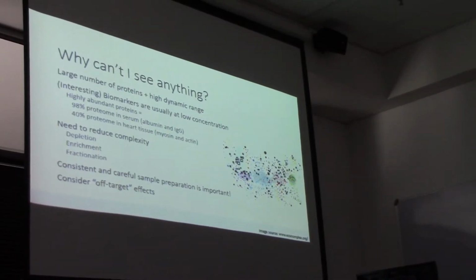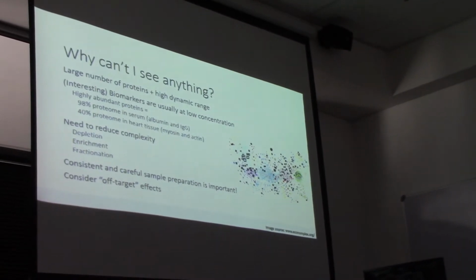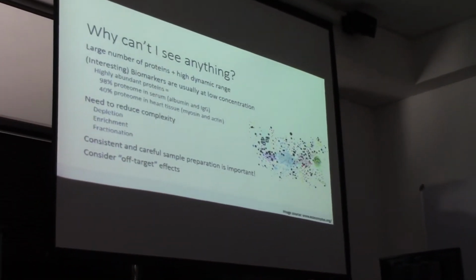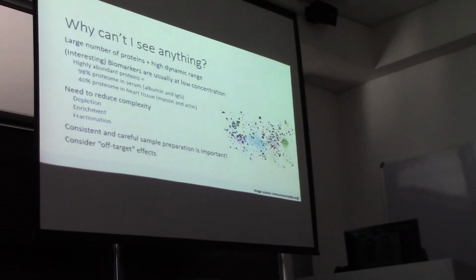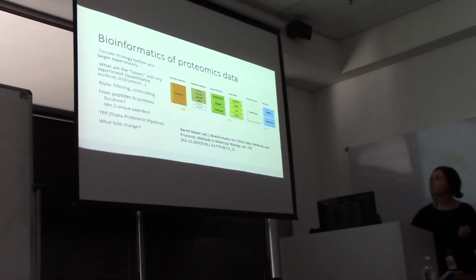You have proteins that act as your housekeeping proteins that you can use to normalize your data. People normalize on total protein abundance as well. That's a strategy. I really encourage you guys to read as much as you can around what people have done in your field, but also in other fields, because there are some very clever strategies to get around these issues.